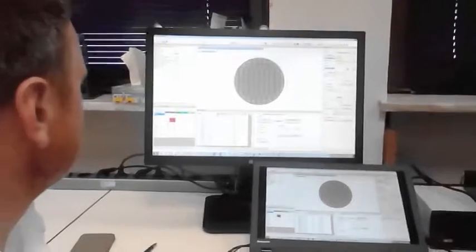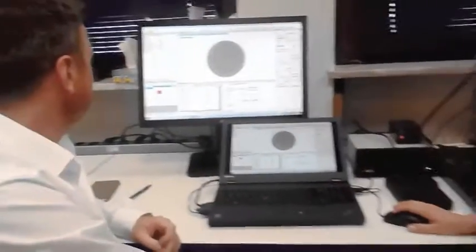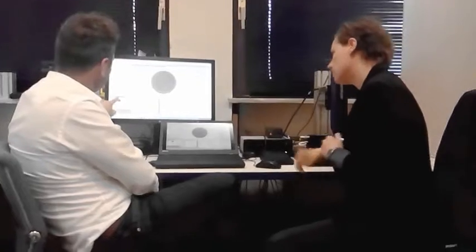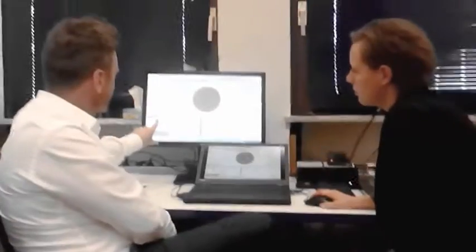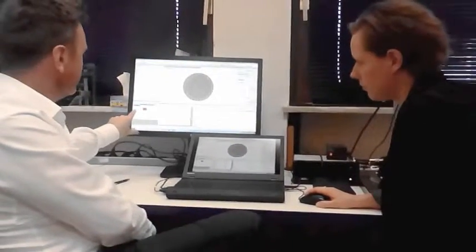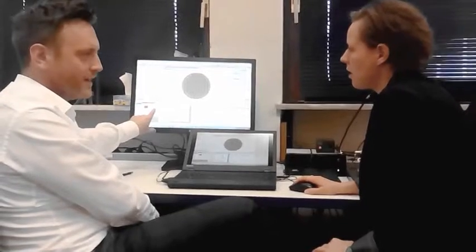So this window shows you the particles sorted according to a standard. In our case, it's the VDA standard. Just to reiterate, the VDA BD19 standard is saying that in the red column here, the maximum, and this is why it's turned red now, in the 50 to 100 micron class size, the threshold limit is 250. We are allowed to have 250 particles of this size in this area. The reason it's red is because it has counted 259 metallic particles, so it's a failure.